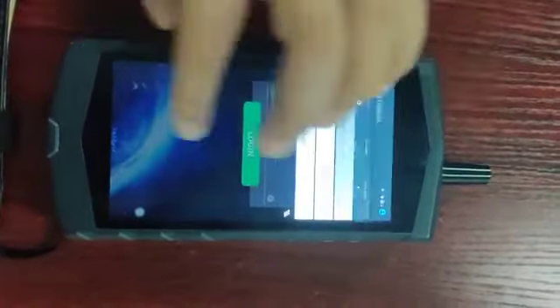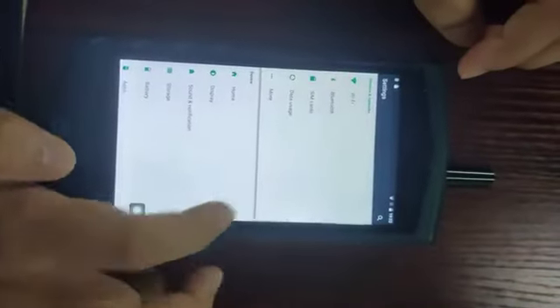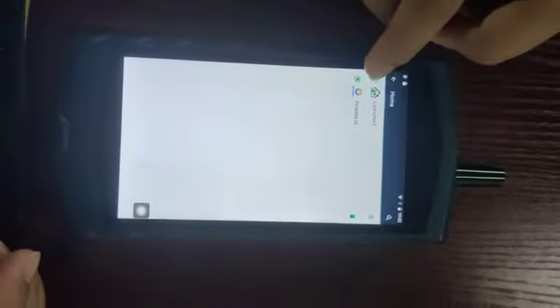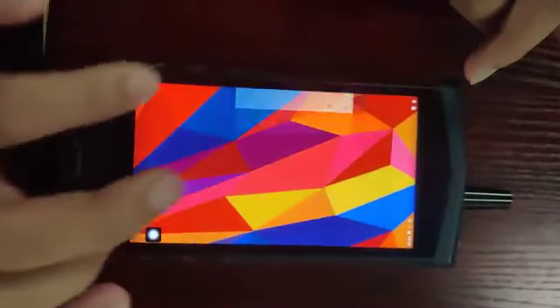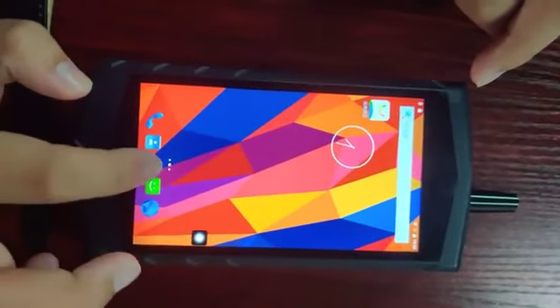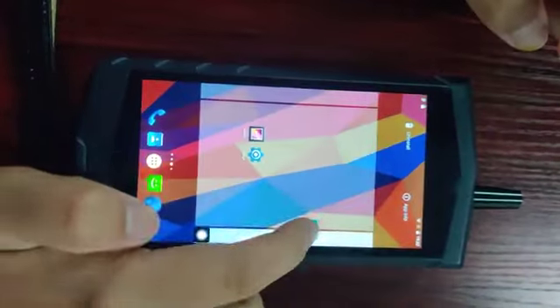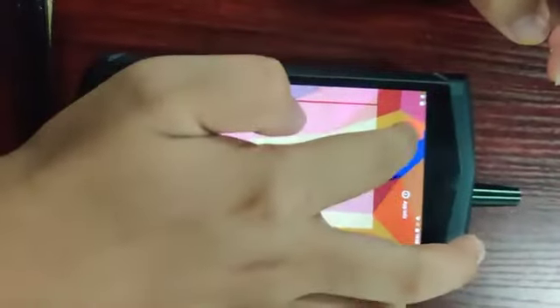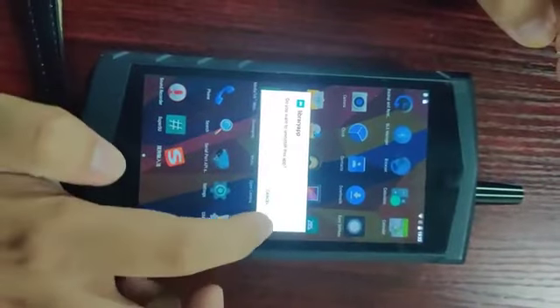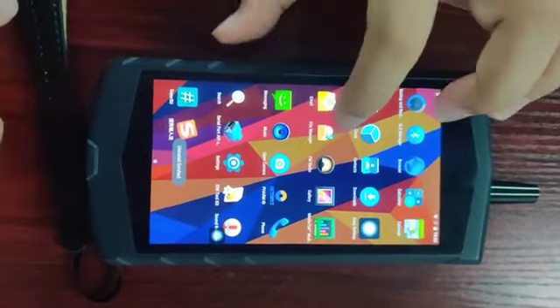Firstly, slide down and click setup. Here you can choose home or launcher. Click launcher, and you can click the white spot to return to the background. After that, click the middle and uninstall the library app. The library app has been uninstalled.